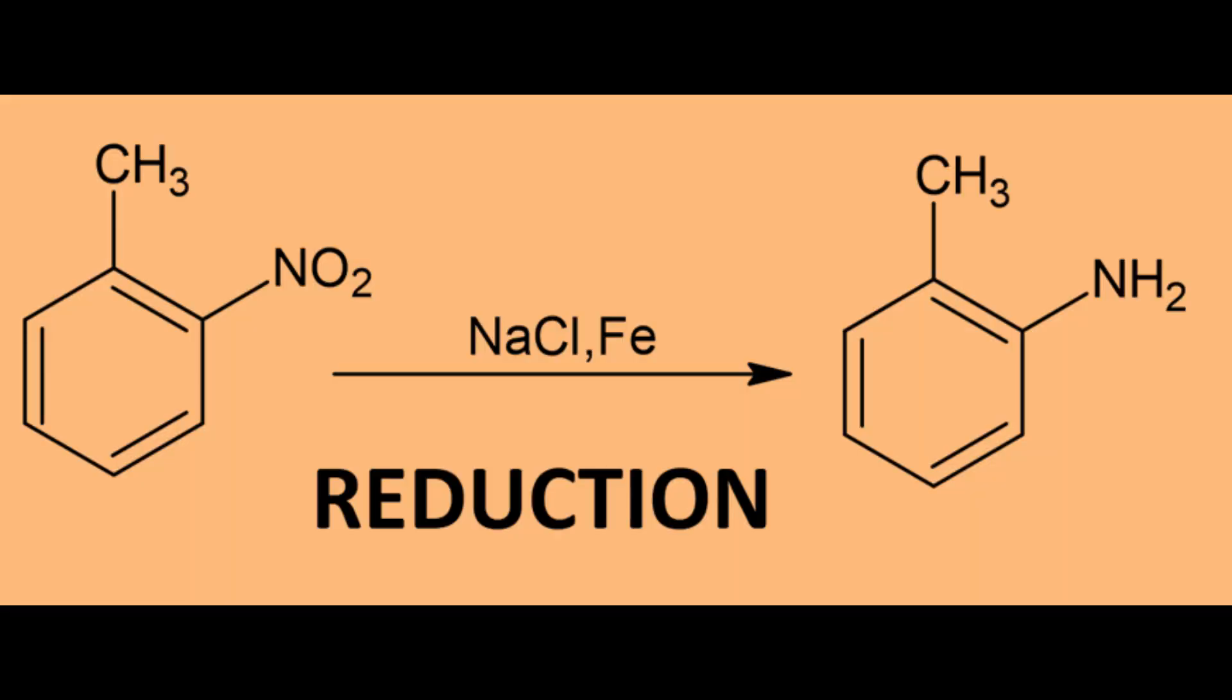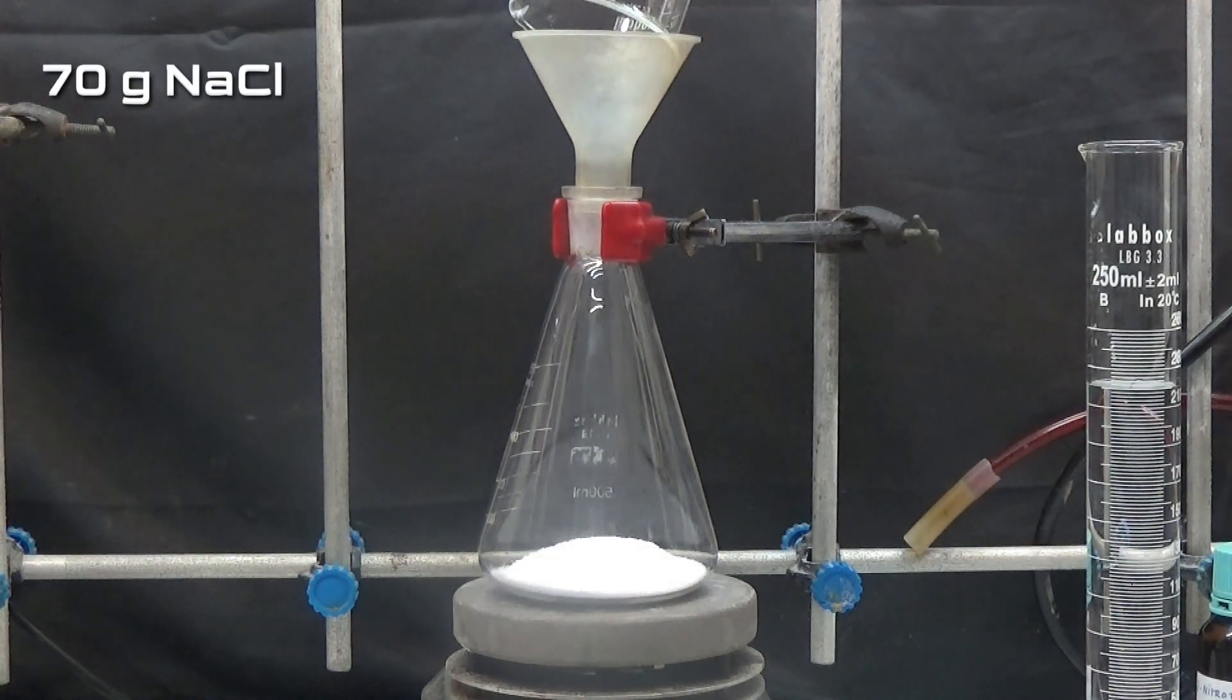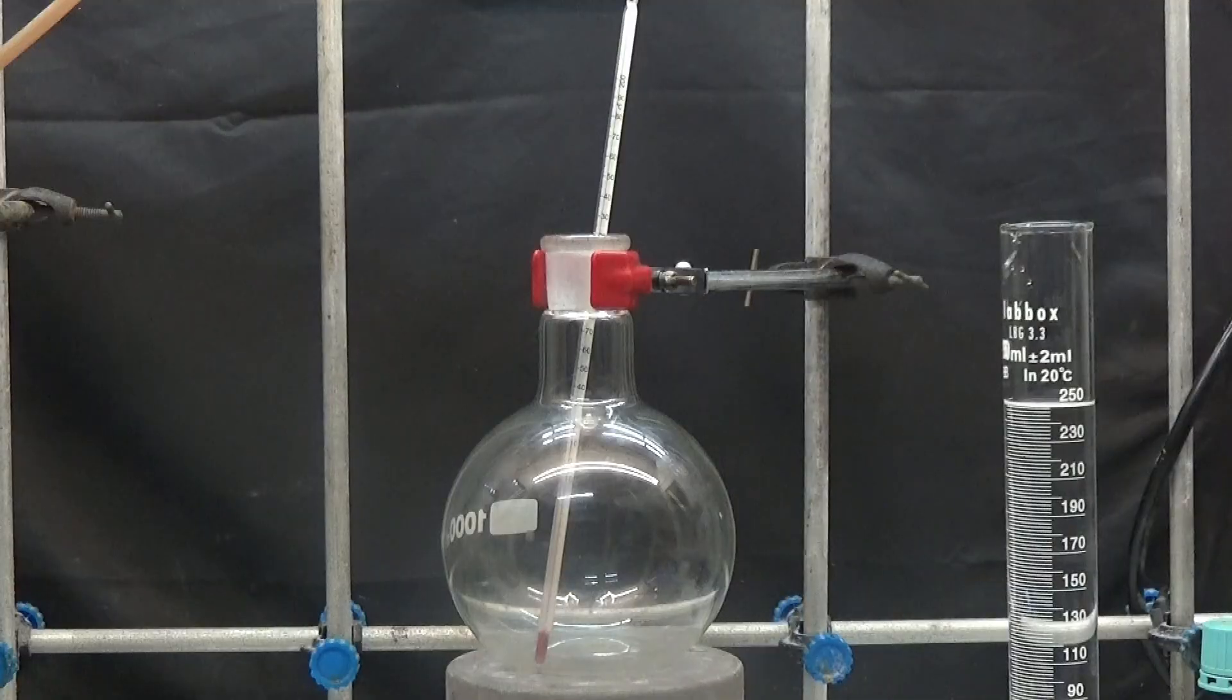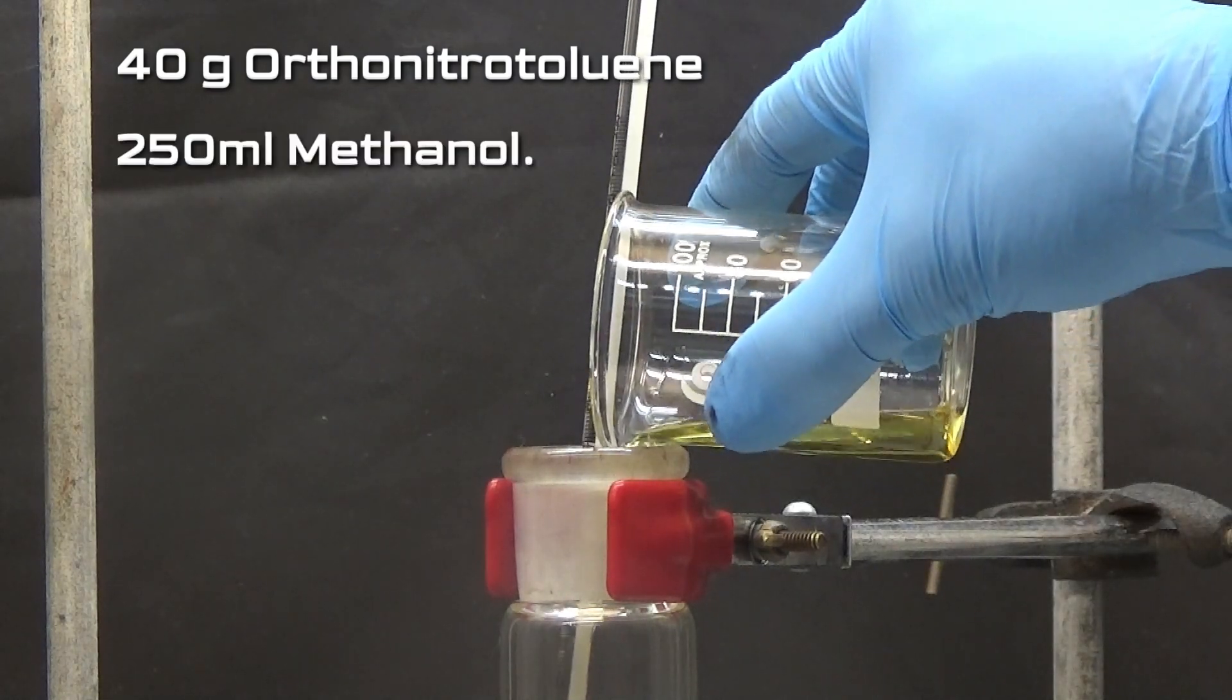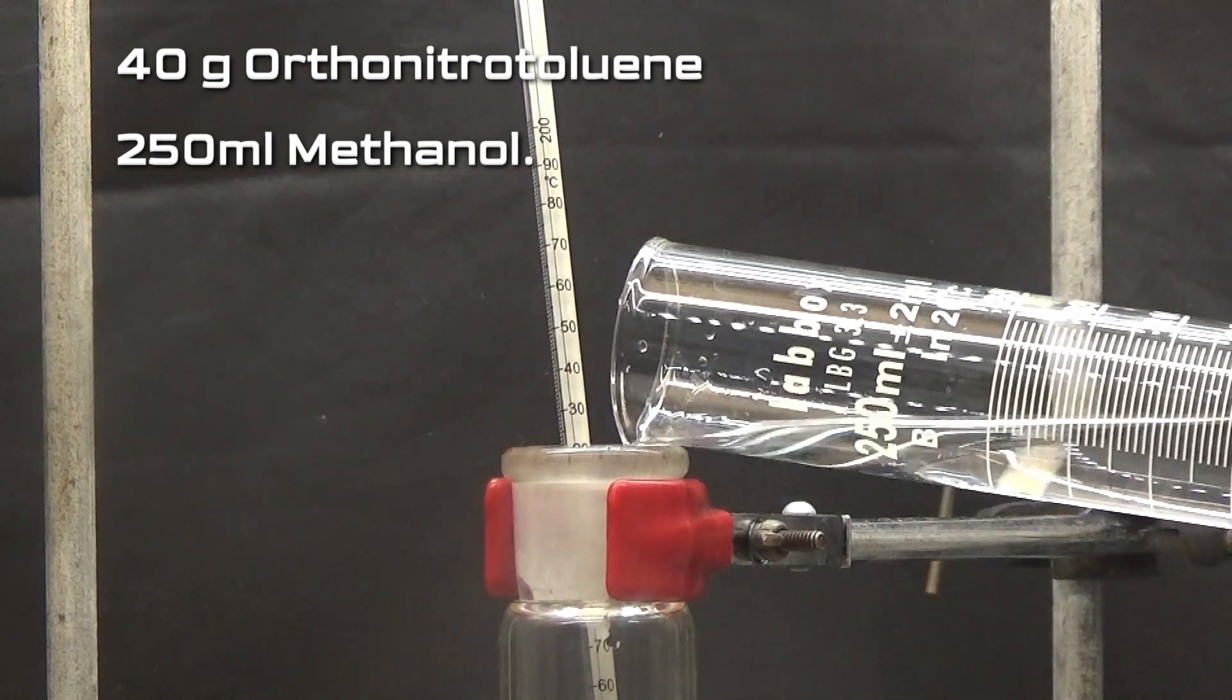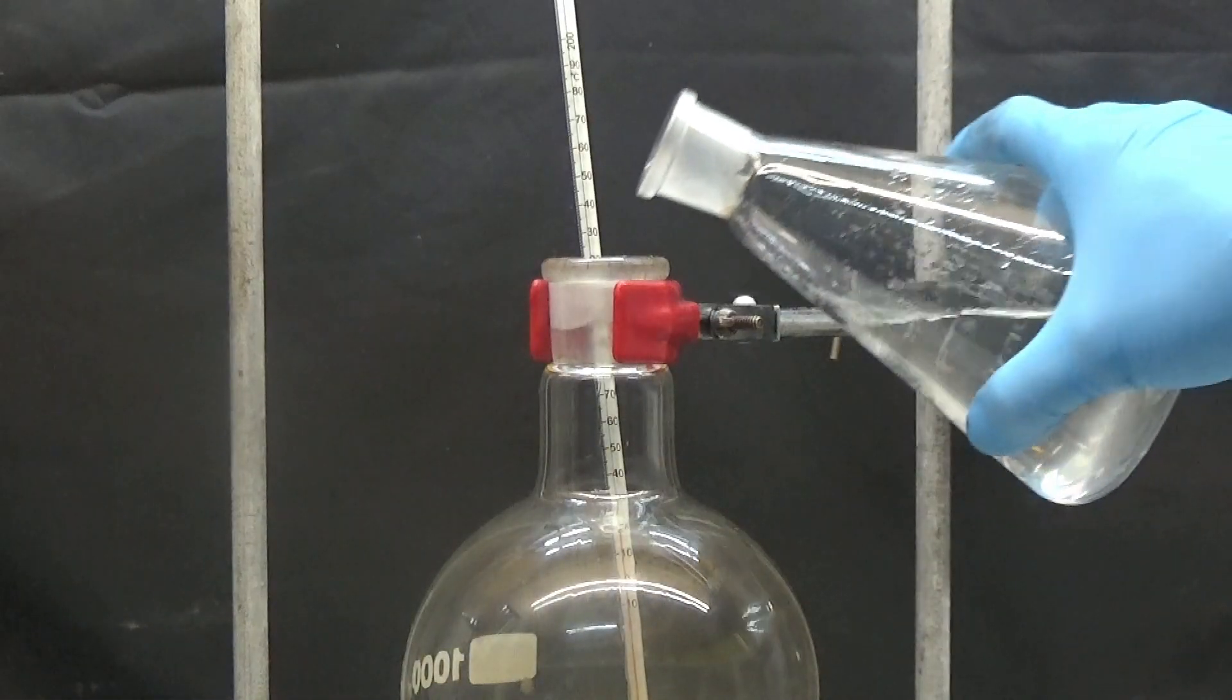The next operation is to reduce the nitro group to amine. To obtain toluidine we are going to reduce the nitro group with iron metal in a sodium chloride solution. The first step is to prepare a solution of 70 grams of sodium chloride in 220 milliliters of water. In a 1000 milliliters flask we put 40 grams of orthonitrotoluene and dilute it with 250 milliliters of methanol. Add the sodium chloride solution.